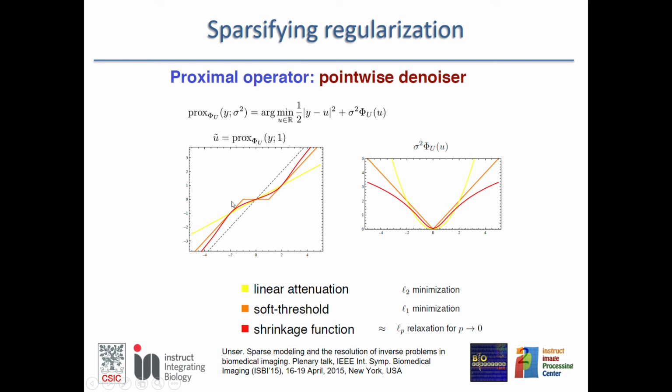And you can construct smooth approximations to the soft threshold proximal operator. So the idea is that you follow the standard 3D reconstruction process in which you minimize the reprojection error, and as you iterate over the volumes, you transform part of your coefficients.